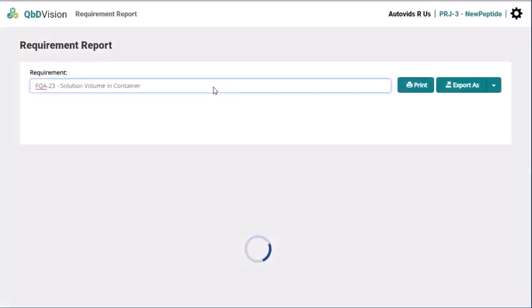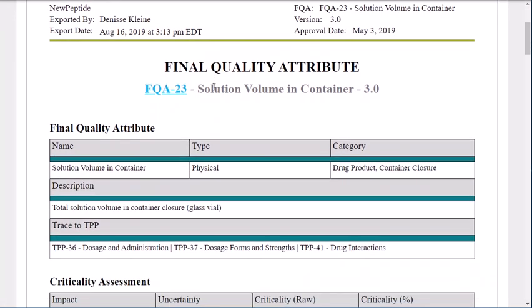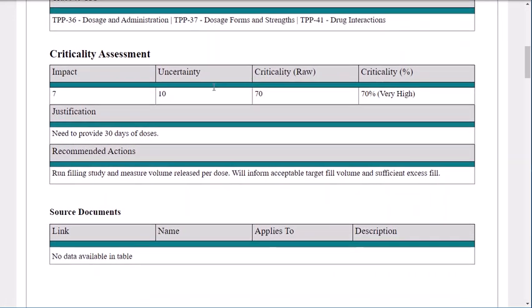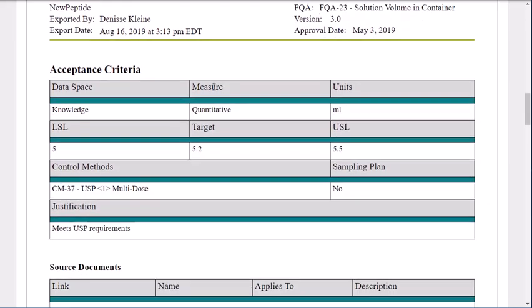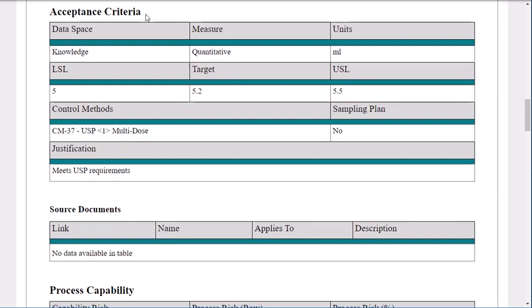Each requirement has limits that must be adhered to in order to be considered acceptable, known as the acceptance criteria, or acceptable qualification limits. This is a significant factor for analytical method development in particular. Any linked documents or references, such as certificates of analysis, are shown in the report. A full explanation is provided for the attribute's risk control, identification and effect on the process capability.